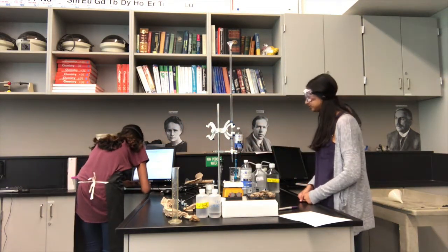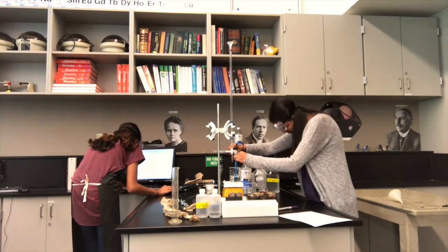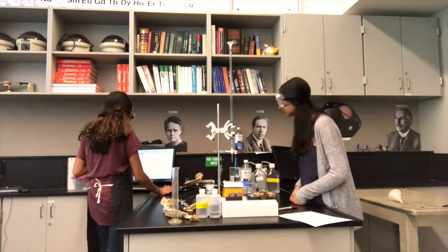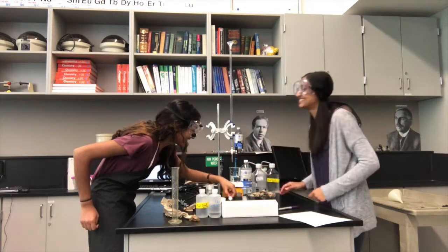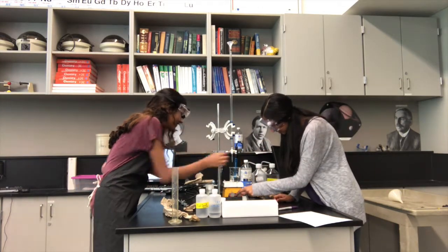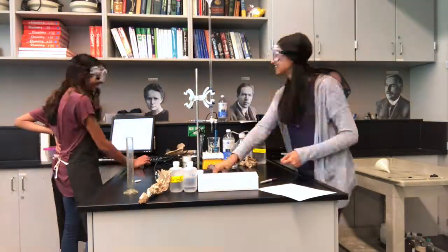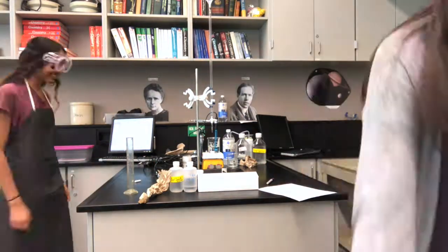Now it's time to begin the titration. Add drops of acid into the seawater in intervals and record the volume each time. Please don't forget to put the stir rod in — every time. Keep titrating until you reach the end of the buffering capacity and the pH drastically starts to change.